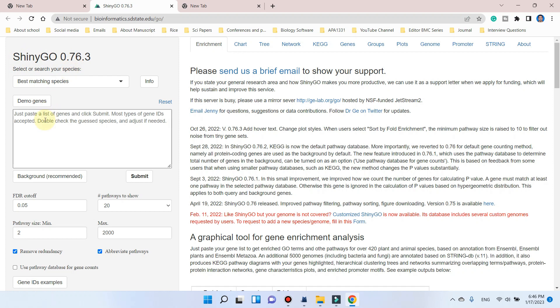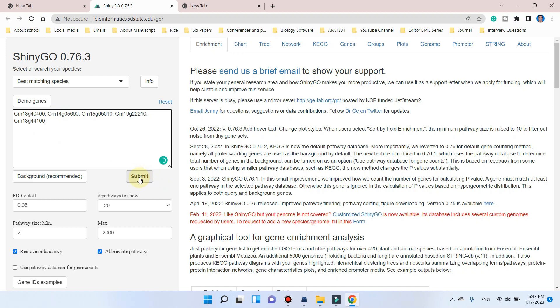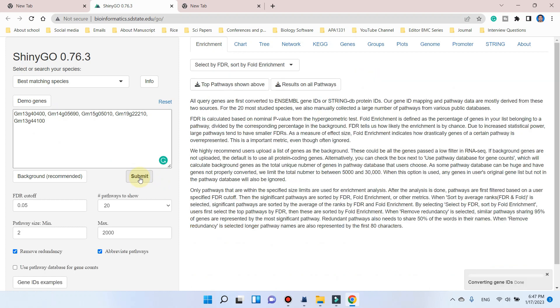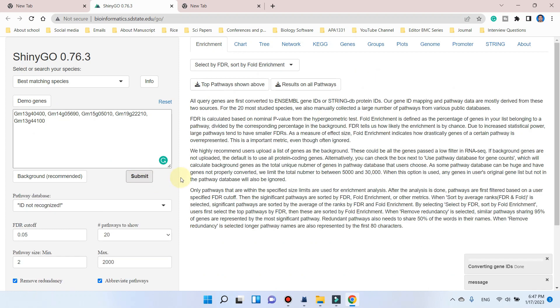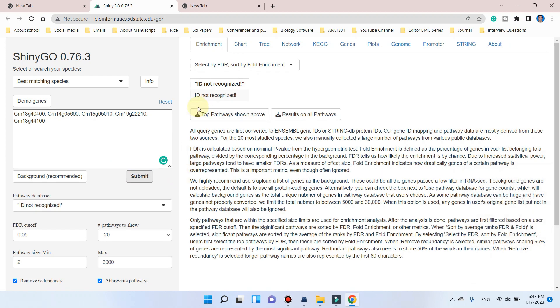Let me enter a few genes of Glycine max, for example. Here you can see, while we have entered and we try to submit this, you can see here we face a problem that ID is not recognized.